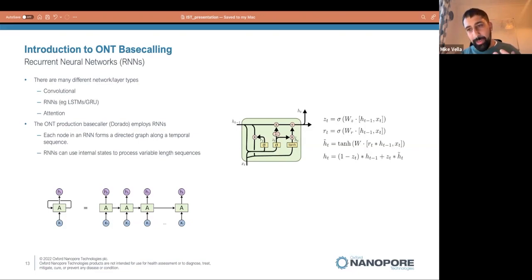Another advantage of RNNs is that while historically they've been known as a rather slow model to train and to perform inference on, and the reason for that is that they've got a data dependency in there, we've been able to optimize these models quite heavily, and I'll be talking about that later as well. So we achieve very high inference performance using RNNs. I would definitely bet that for many of our models, state-of-the-art inference performance is achieved. And specifically, we use the LSTM.